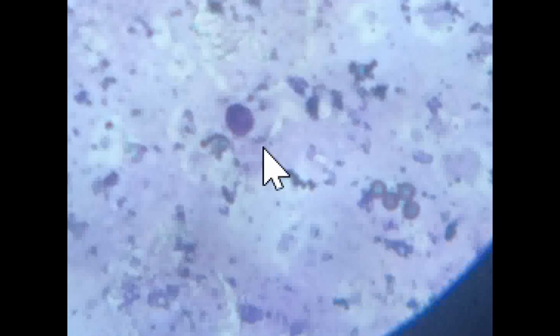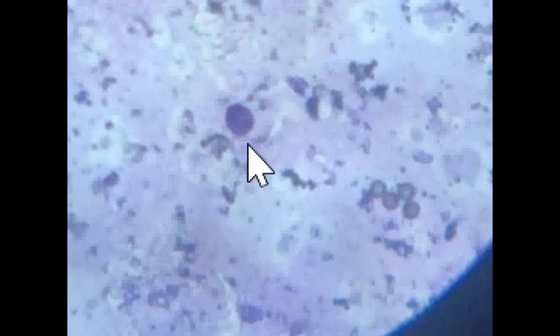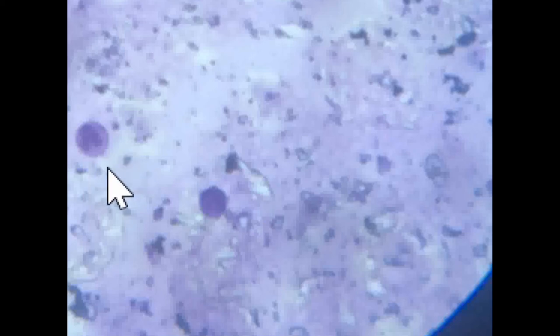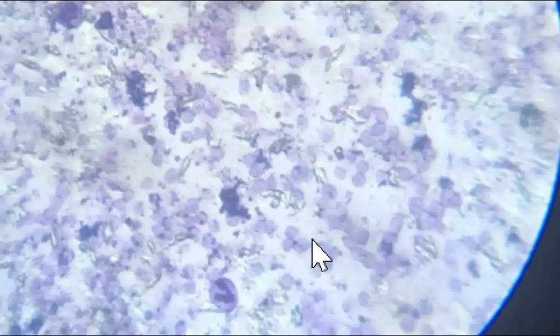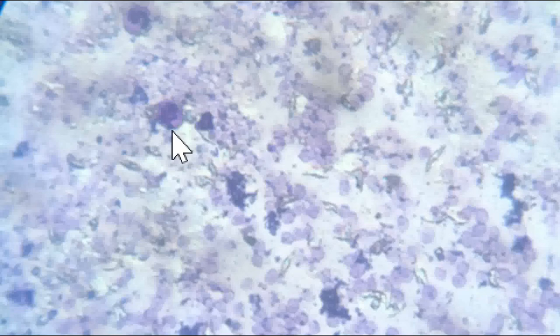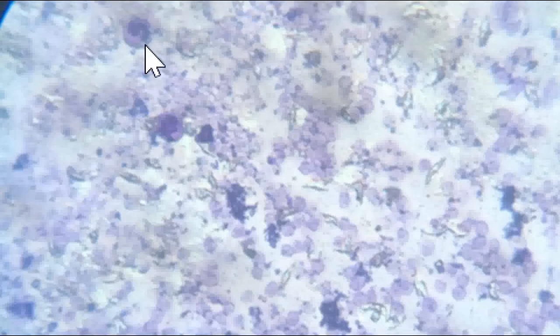Under the microscope we can see a basophil — we know that basophil has a horseshoe-shaped nucleus, but because it is filled with granules, that horseshoe-shaped nucleus is not clearly visible. Here we can see another basophil, and this is a monocyte — the monocyte is a WBC with a kidney or P-shaped nucleus, which we can very clearly see here. Here is an eosinophil with two lobes and a connection point, and this is a monocyte as well.